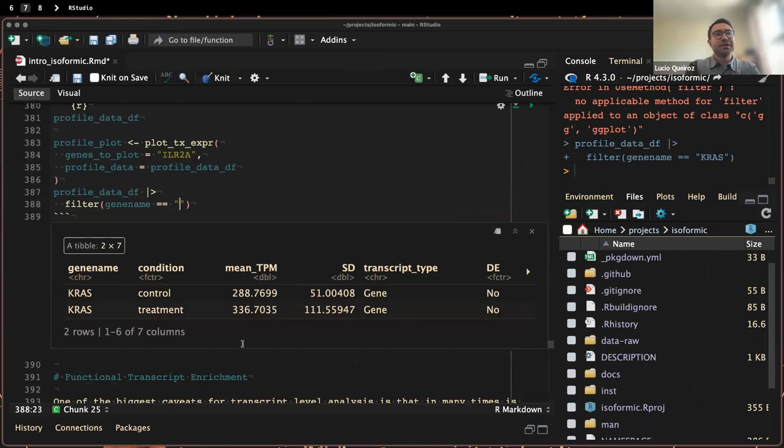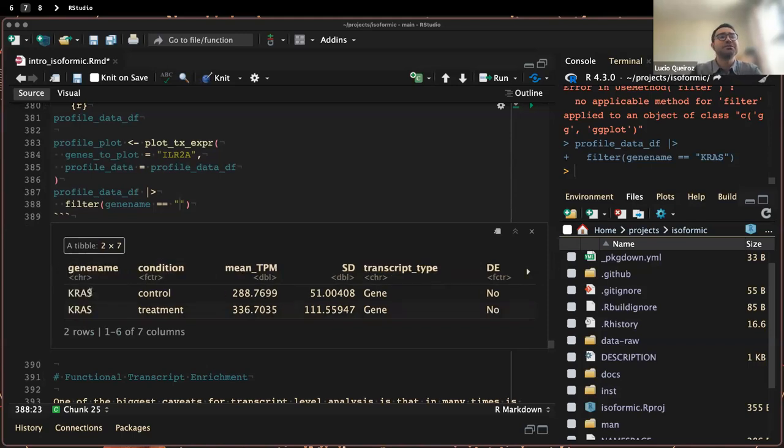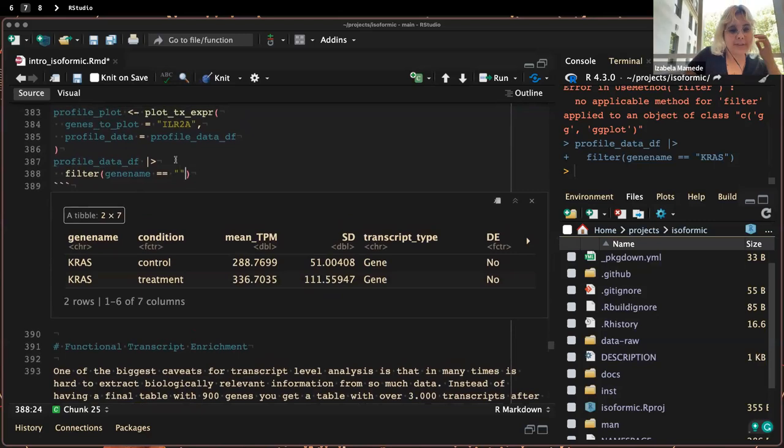So we see that you actually see an increase in the mean around the treatment, but the standard deviation increases also. So that's probably why it's not appearing. Did this just have one transcript, right? Yeah. I have to check why it's not showing the transcript, but it's probably because no transcript was differentially expressed. Yep, it's pretty much that. So it didn't get everything.